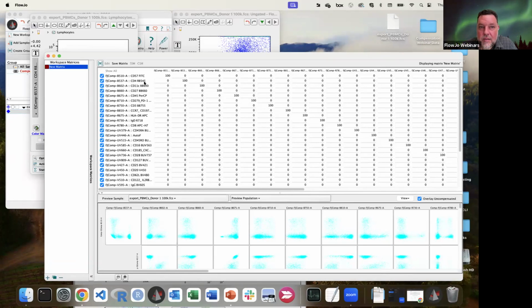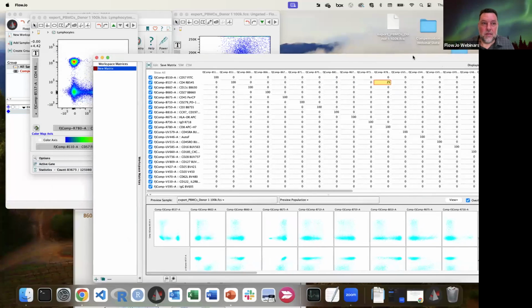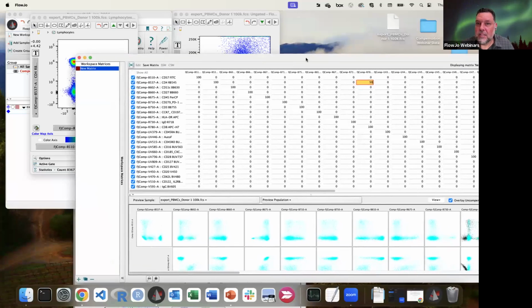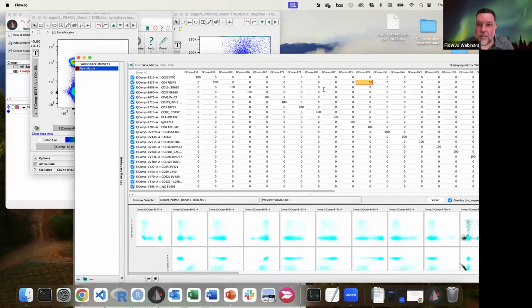Yes. So I'm going here into R780. Now what happens when I do 25? I need to apply this matrix, right? First to see the effect of it. What happens if I put 50 in here? Oh, see, I don't even know. This is called demo-itis, where I haven't played with this and given you a perfect example.